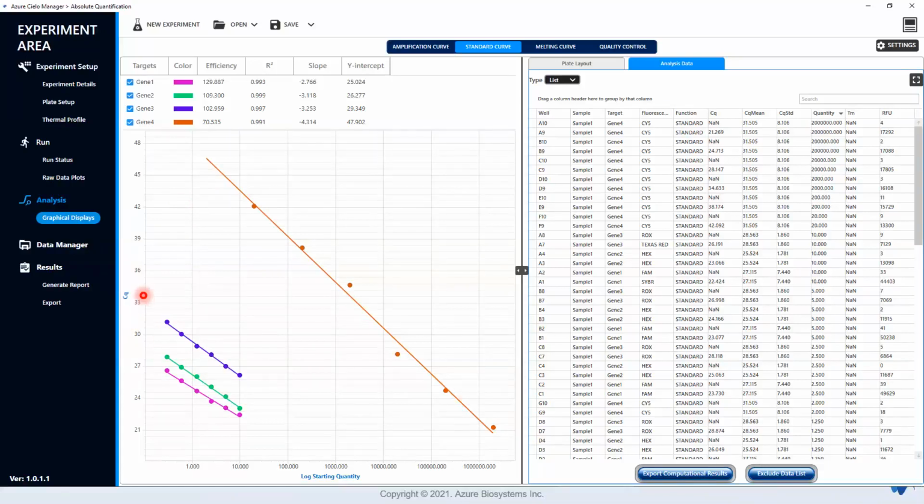You extrapolate from this standard curve using the CQ value. For example, your unknown sample has a CQ value of 30. So you plot it like normal, how you get the value from a standard curve: from the 30 CQ value, dot over here, then come down over here. So you have roughly, I'll say 10, maybe 12,000 or maybe 20,000 copy number.